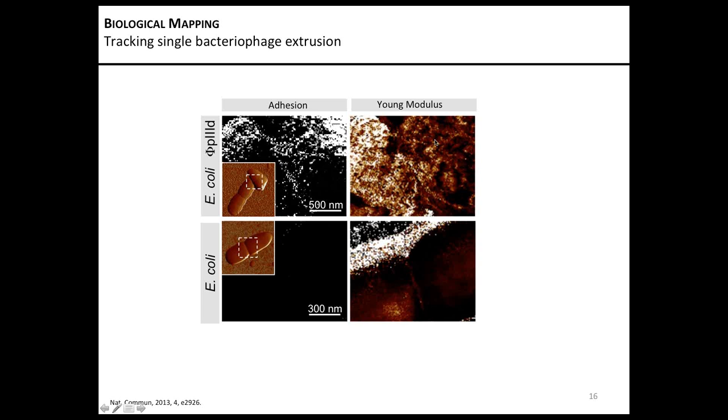And at the same time, we see that the Young modulus image is very complex, because we think that all these inserted channels are perturbing the Young modulus and the assembly of the peptidoglycan. On the cells not infected by the phage, you have no adhesion and a nearly homogeneous distribution of the Young modulus across the cells.